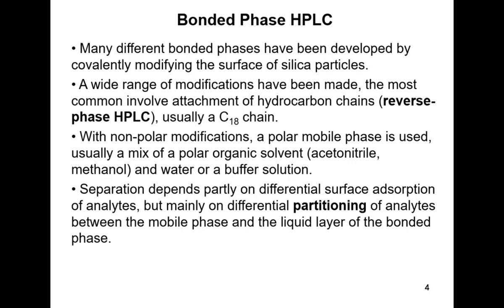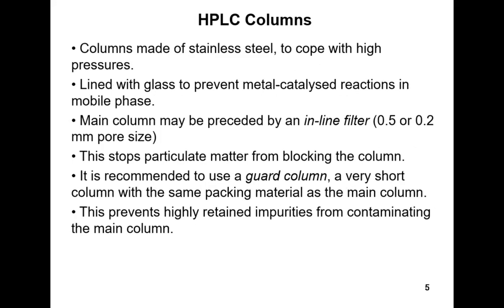So I'll come back to discuss those in a bit more detail, but first of all, we're starting from the outside and moving in to think about what's happening inside the column. First of all, we'll think about the columns themselves. You've seen the column in the practical class, but you can have a closer look at it if you're not familiar with them.